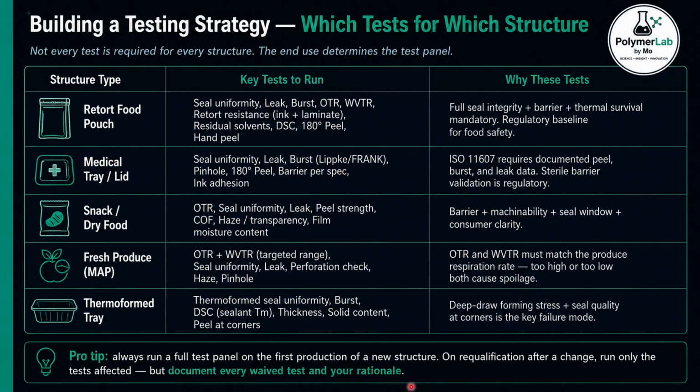The pro tip I want you to carry out of this video: on the first production trial of any new structure, run the full test panel. You will never have a better opportunity to establish a complete baseline.